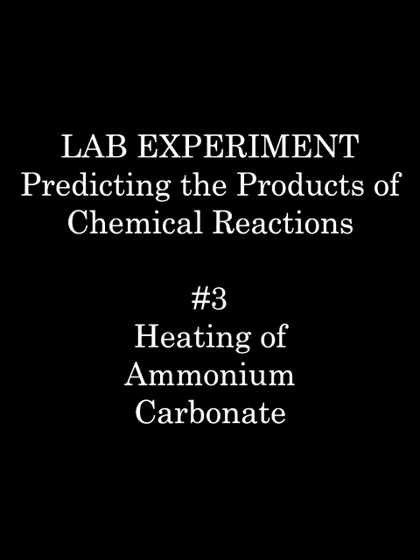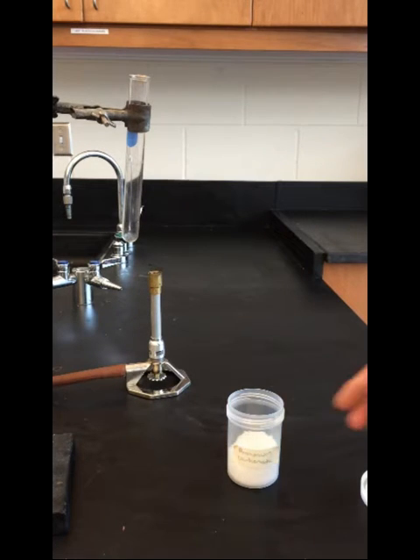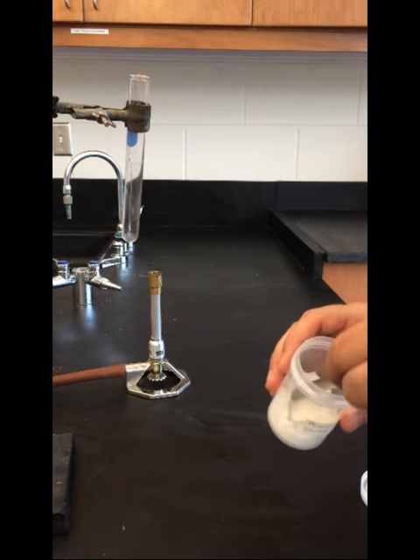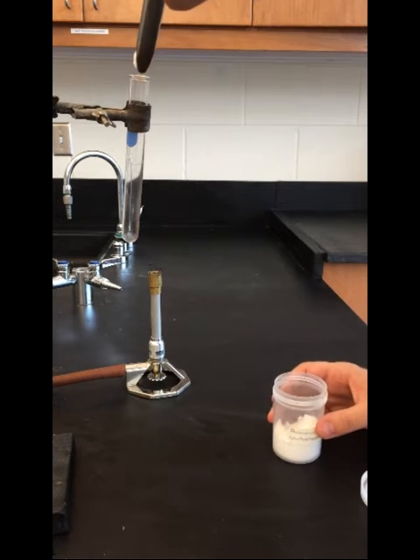In the next reaction, we'll heat ammonium carbonate. Here's the equipment that will be used. This experiment, just like the last one, also requires gas collection. A small amount of ammonium carbonate is transferred into the test tube suspended above a Bunsen burner.